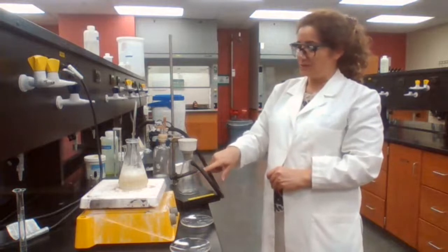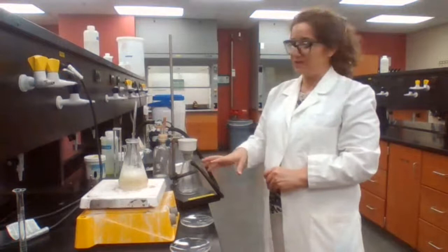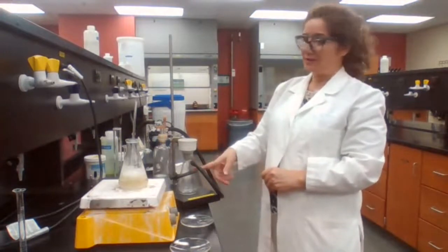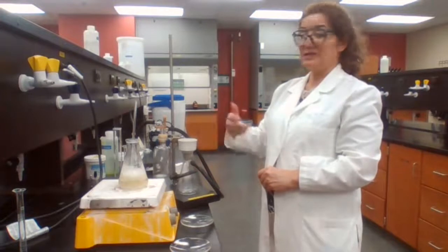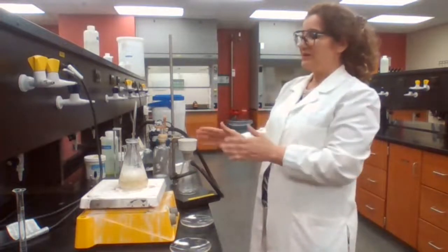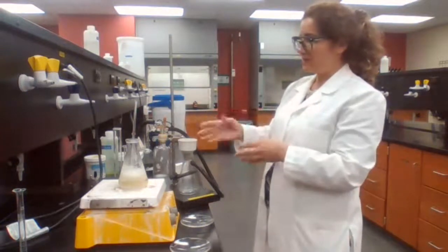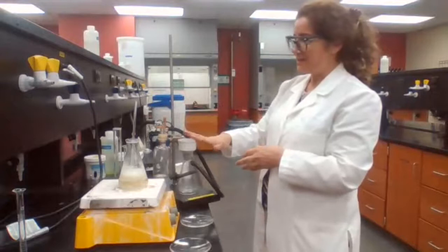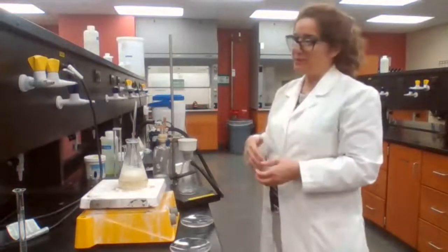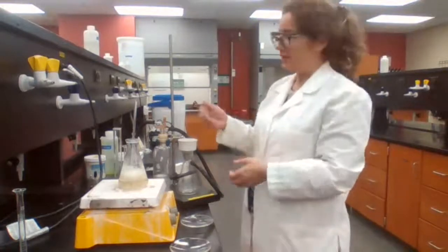As soon as two-thirds of the flask is filled with liquid, stop the vacuum, pour the liquid out, and then use it again. When you are done with the experiment, the setup should go back to the right assembly. Make sure everything is in place and put it back in the cabinet called vacuum system. It doesn't stay out all the time.